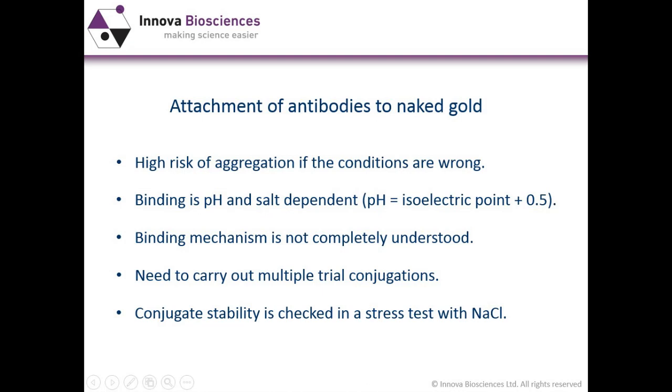Okay, turning on now to the second approach. This is attachment of antibodies or large proteins to naked gold.